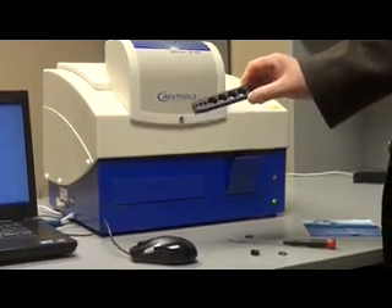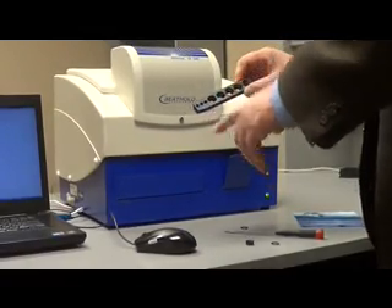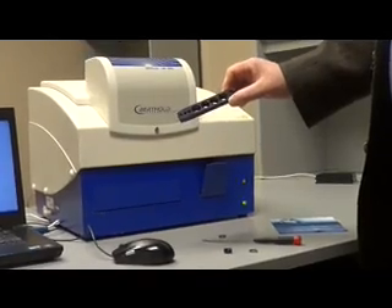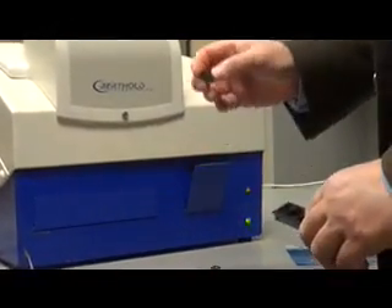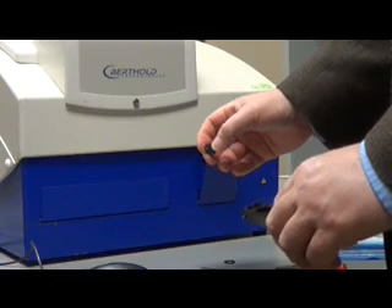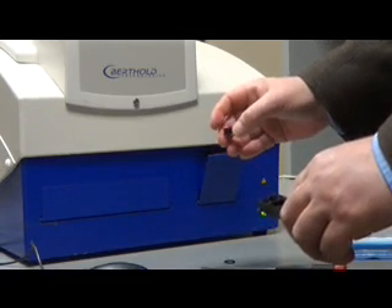As you can see, this is position one, two, three, four, and five. We are actually going to install this 485 nanometer filter in position number two. So we take the filter and look for the arrow on the filter.